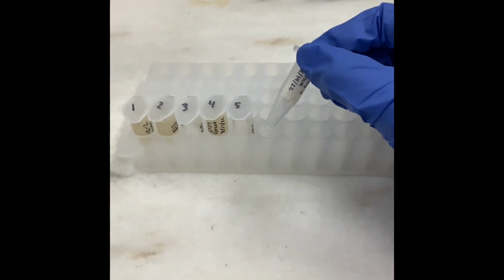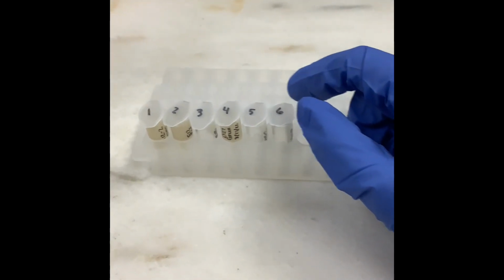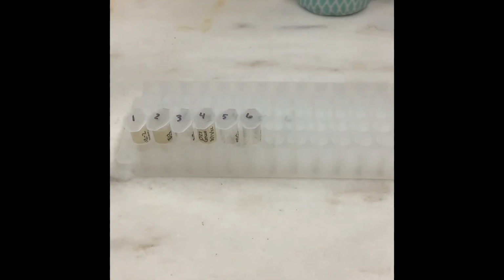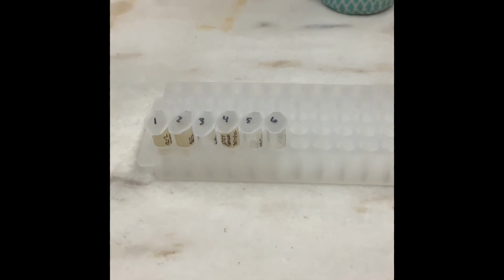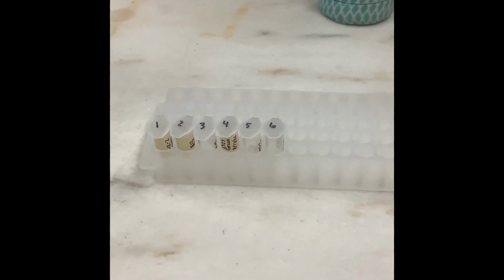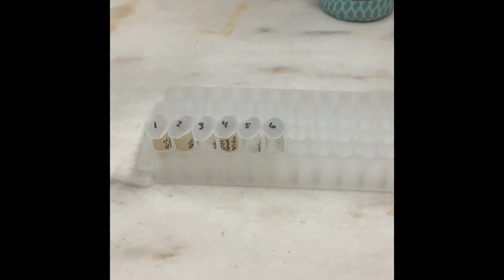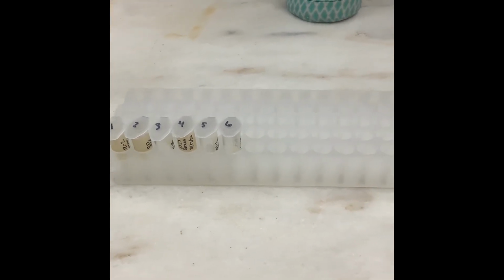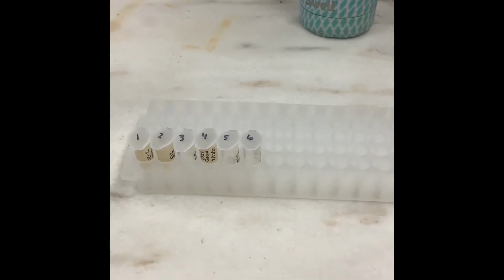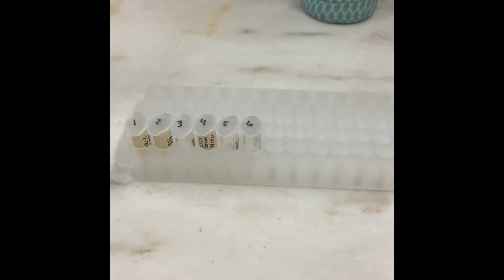So now that the cotton is off the Q-tip, these samples are ready to start the acetolysis process. They can also be stored in the freezer until you're ready to acetolyze them. Personally, I like to prep an entire week's worth of samples or more at one time. Just take a day to do that, and then I like to process those samples day by day. I think going from the prep stage to the acetolysis stage every single time you want to do acetolysis is less efficient than just prepping a whole bunch of samples one day and then acetolyzing a whole bunch of samples the next day.